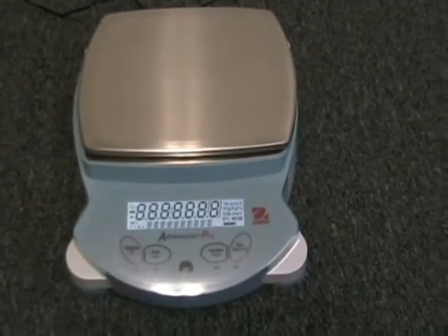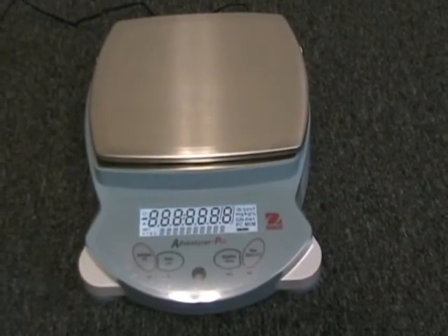The O-House Adventurer Pro family of weighing balances combines unsurpassed value with solid reliability. Adventurer Pro balances are affordable, accurate, and easy to use for all of your basic weighing needs.